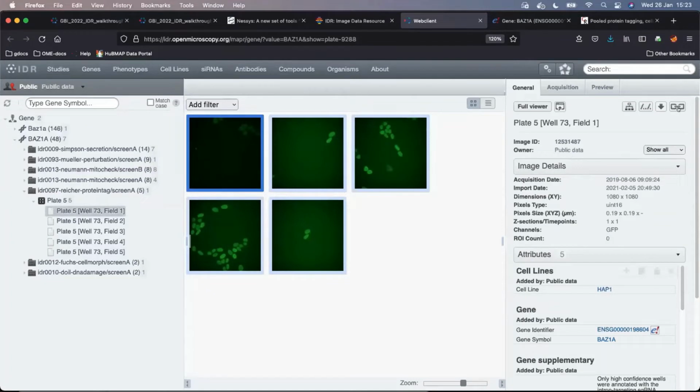If you want to see all the images inside that study, you can navigate to this study in the view which we inspected before by going to the right-hand pane, selecting an image, and navigating to an icon saying show parent project and dataset in the tooltip. This is just the one I'm hovering over.